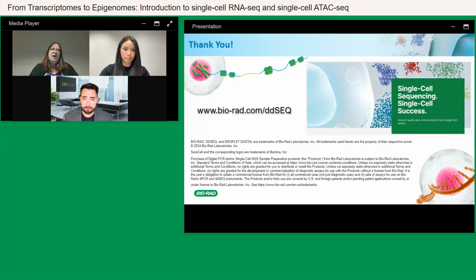the cytoplasm. However, if you wanted to include gene counts from the introns, you can go into the input YAML file, which is a YAML file that is used to put all of the information, including parameter settings, when you go to run Omnition. And so you can say to include introns in your final gene count in that YAML file.